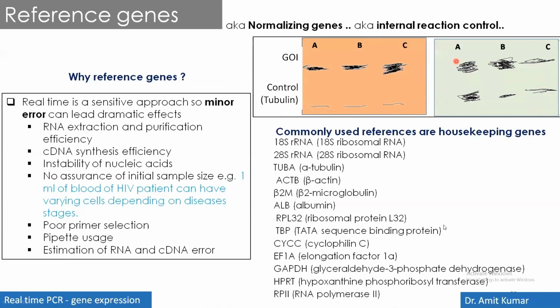You have A, B, which is increasingly expressed in comparison to sample C.